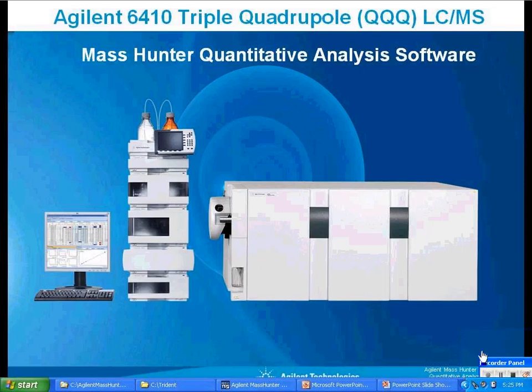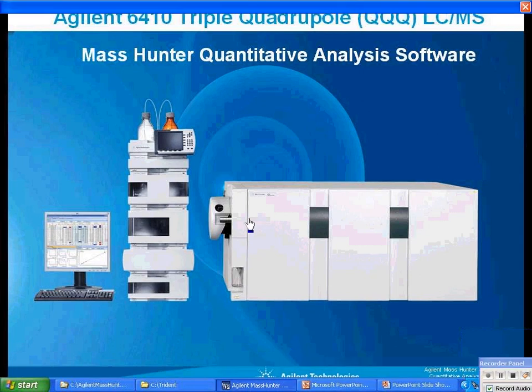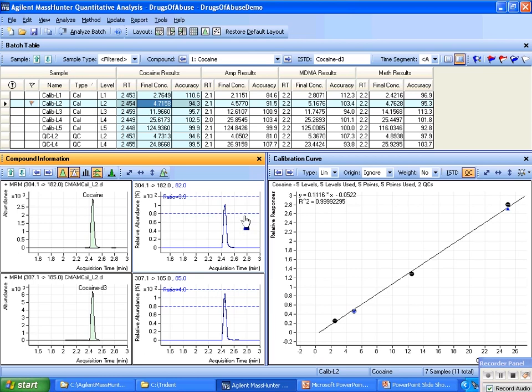Let's spend some time talking about the calibration curve. The calibration curve is the centerpiece of quantitation, and managing your calibration curve is really the essential part of quantitation. So let me demonstrate what capabilities we have in managing the calibration curve.